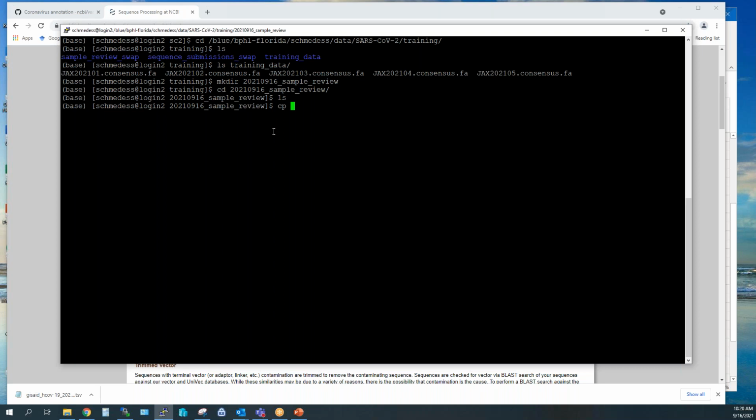But I know that there have been some updates to the Dragen pipeline in the past, and I just want to make sure that this is compatible with everyone. So we can go back and forth and make any edits, just in case there's something that I am unaware of, since we don't use that pipeline. Okay, so we're going to copy over the script. So these will be in your, whatever your state is.